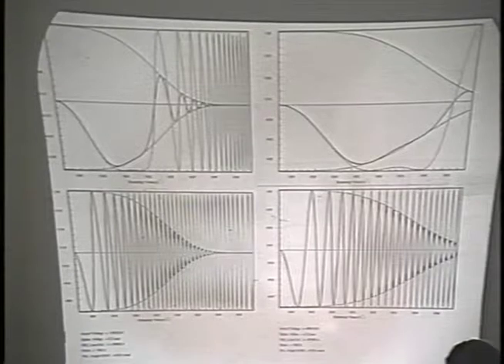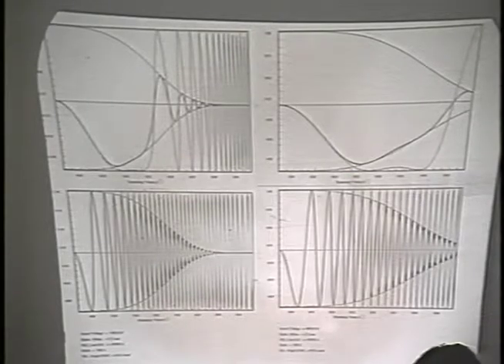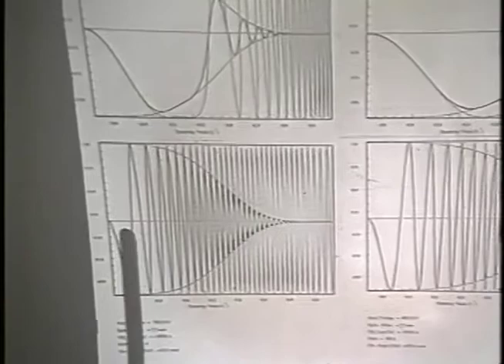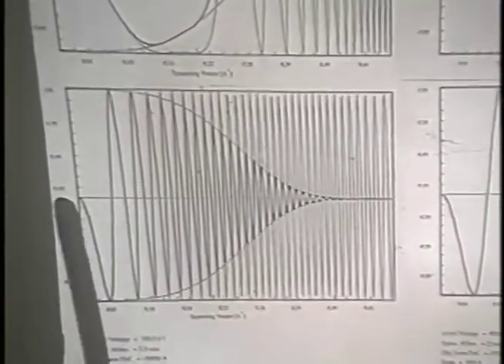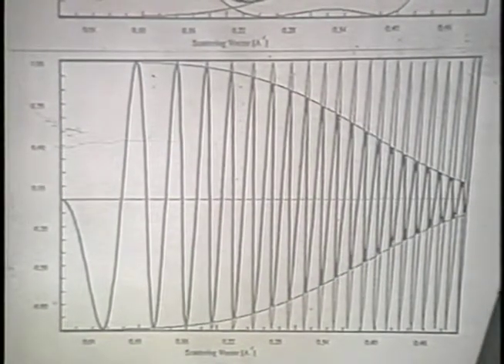We, from time to time, end up taking pictures at about 1 micron under focus, and the effect of high voltage here is again to stretch out these oscillations so that within the resolution range of interest there are fewer oscillations in the sine function, which is good in one sense.